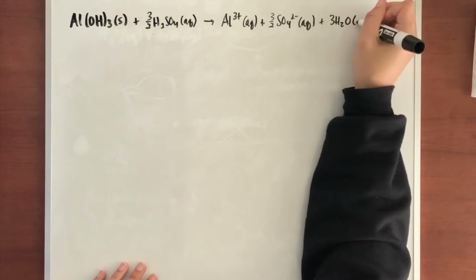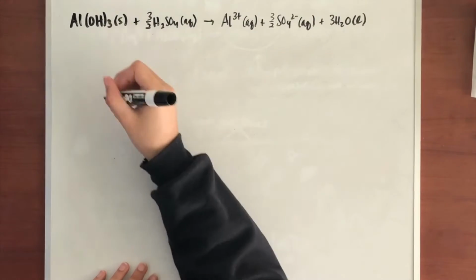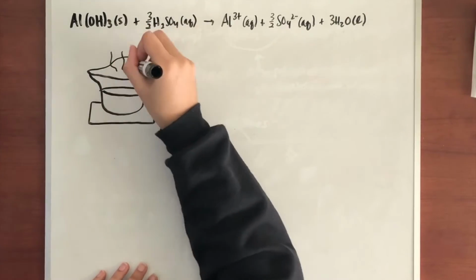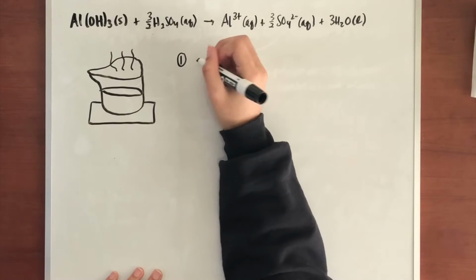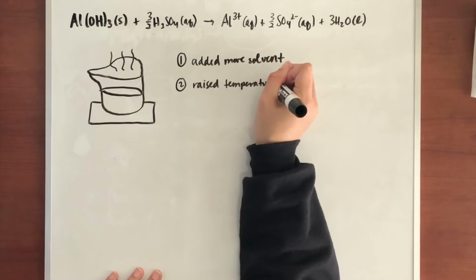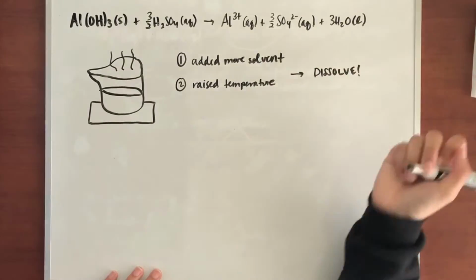This is going to increase the interactions between solute and solvent molecules and therefore increase dissolution. And then we heated the solution to raise the temperature. This was going to break the bonds between solute molecules and encourage them to dissolve into the solvent.